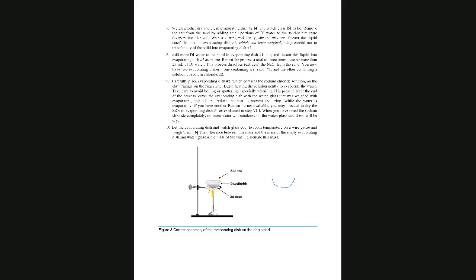For drying and evaporating, you are going to add a watch glass because you don't want to lose substance. Sometimes you can splatter some and lose it, and you have to work this technique very, very carefully, because if you lose some solution, then when you weigh, you're going to show that you were a little sloppy, the recovery was not as good. So we'll go over that later. This is just the first quick overview of the experiment.